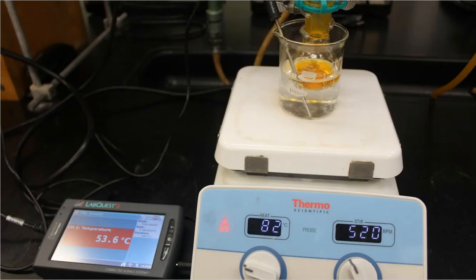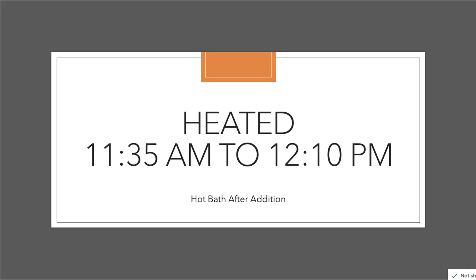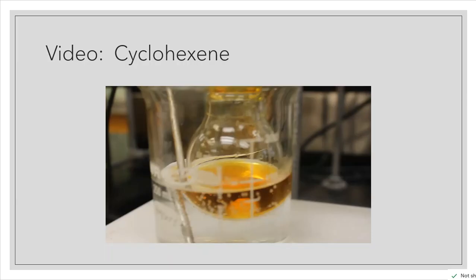So all of that got switched around when I prepped these slides. Okay, so now all of my portions have been added, and the directions say, once you've added everything, walk away from it. Let it do its thing for a handful of minutes, and then come back. Just make sure that the water bath is still 50. It was 53.6, and this heated from 11:35 in the morning to 12:10 in the afternoon. All right, so after 12:10, I come back.